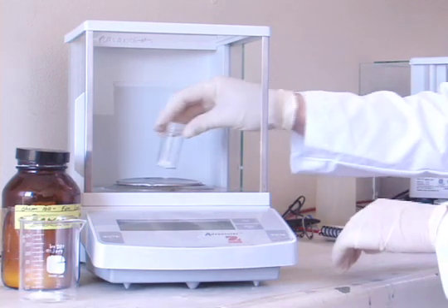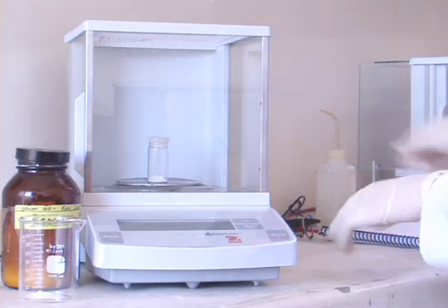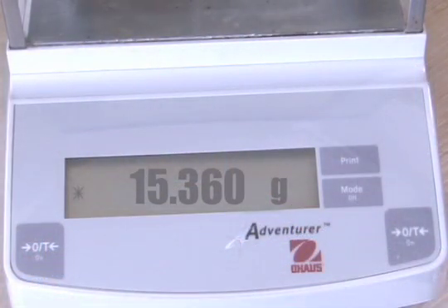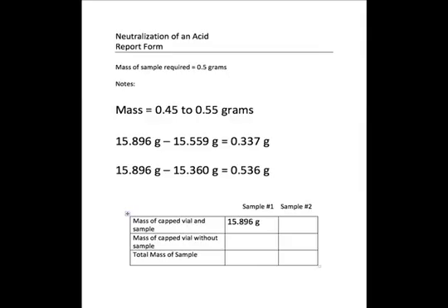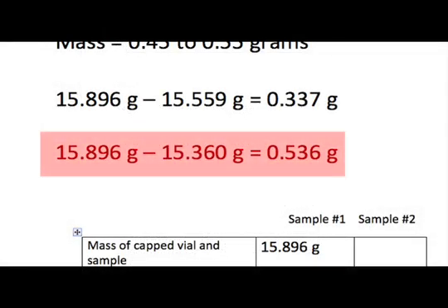The mass of the vial and remaining contents now reads 15.360 grams. This means that the mass of the solid in the beaker is 15.896 minus 15.360 grams, and the mass of the sample is 0.536 grams. This is within our parameters.